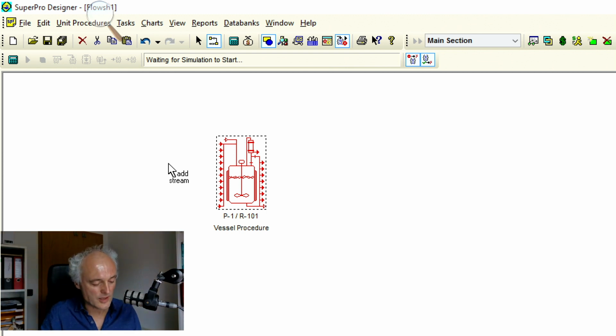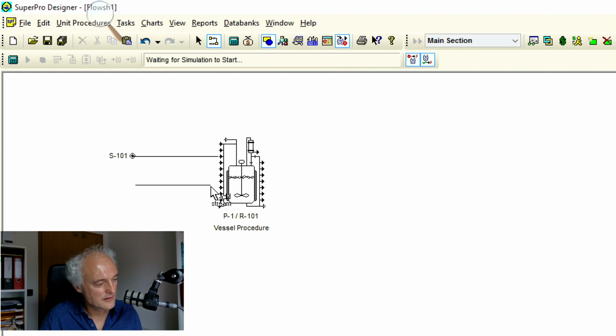And this is what I do now. I add the first stream here. Next stream here. Then I add a stream here. And I add a stream here.